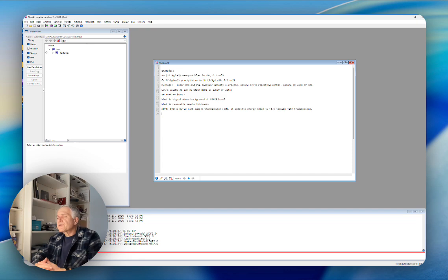So let's assume that we would offer you two choices, 12 and 21 kiloelectron volts. Those are the standard energies which would be available. Most of the time we run at 21. 12 is perfectly fine. We can do that easily. It actually is very stable. And so let's say that you have these two choices and you need to prepare your samples.